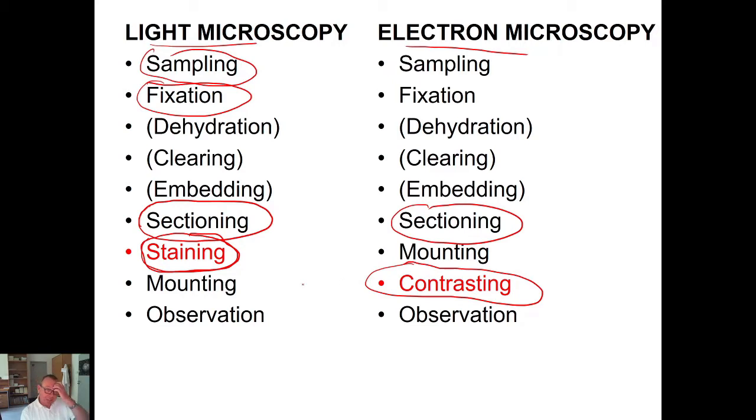The slides also have to be mounted. Mounting is in both techniques, but at a slightly different moment: before contrasting but after staining. And the last step is of course observation. Without observation, the whole previous work would be fruitless. So all slides which are prepared in the laboratory have to be observed.